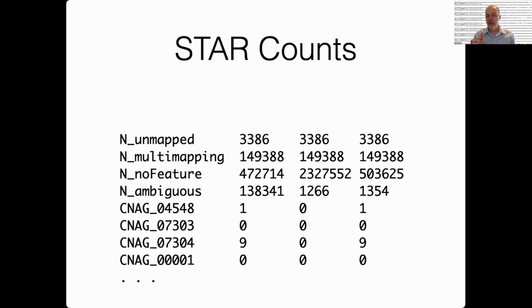I think I'm going to gloss over this, again because I'm running later than I would like. There are some complications that we haven't talked about at all, but there are some methods for preparing RNA-seq libraries where you can actually detect which strand of the genome the read came from.